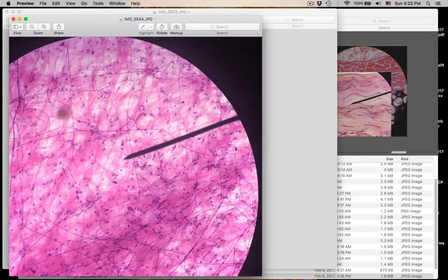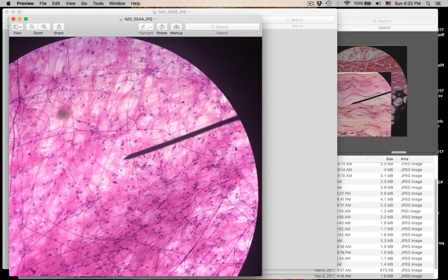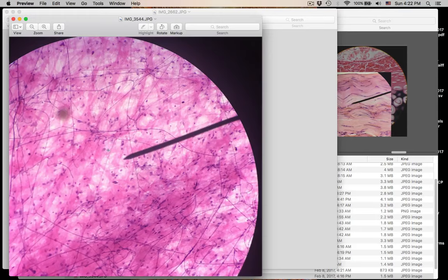Number twenty-three: we have areolar connective tissue again — the pick-up-sticks pattern. What type of protein fiber is the skinny one, this hair-like one? That's elastic protein fibers. The thick pink ones are collagen protein fibers. There are also reticular protein fibers in here, but you need a special stain to see them. Areolar connective tissue has all three protein fibers in equal numbers, made by fibroblasts. This is loose connective tissue proper.